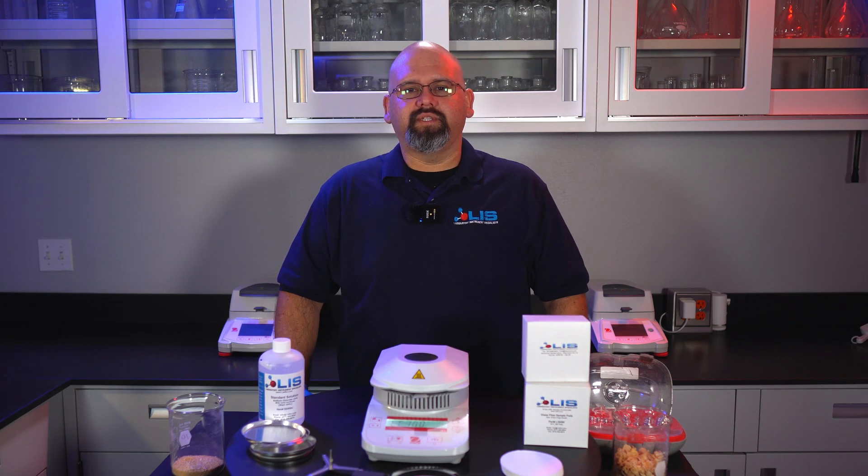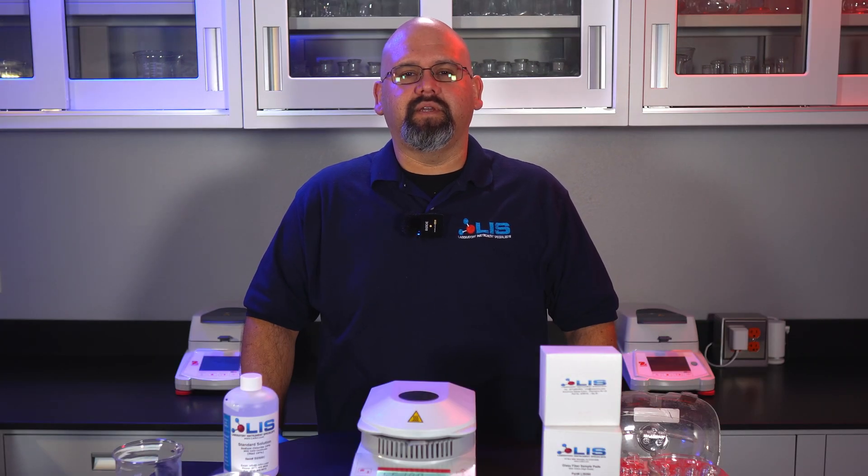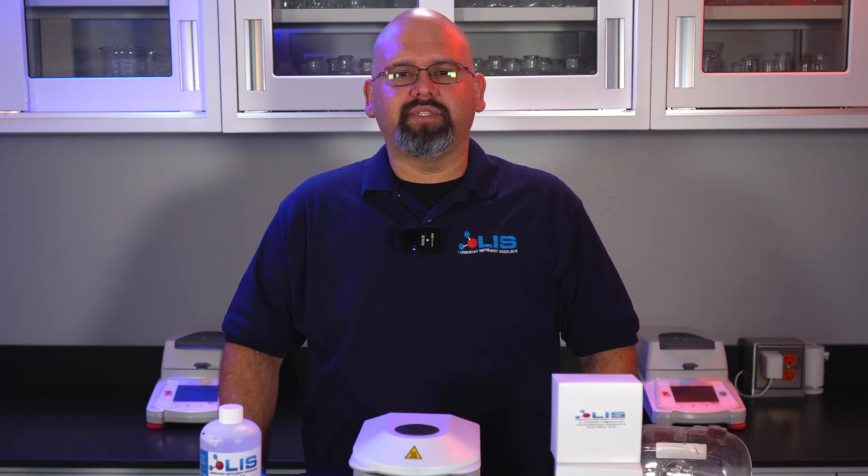If either the weight or temperature calibration is wrong, please contact us here at LIS. We will consult with you on taking the proper steps to ensuring your device gets fixed and is calibrated properly.